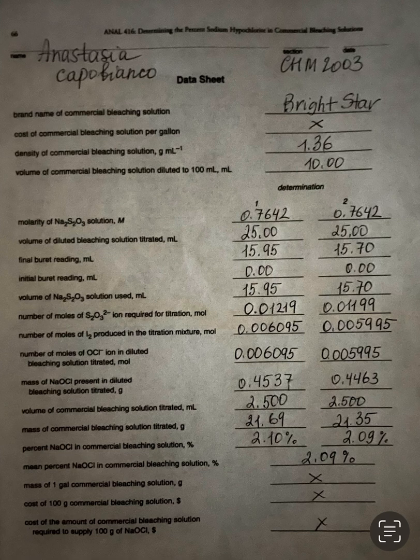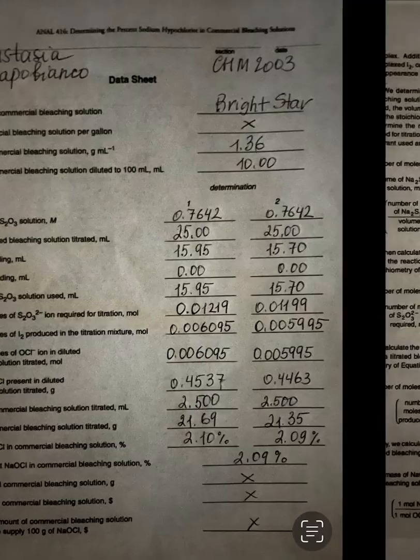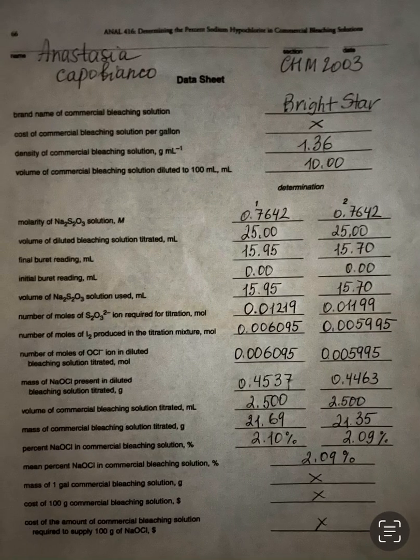Okay. Volume of commercial bleaching solution titrated in milliliters. So they're asking you not to transform it into liters. They're asking you to keep it in milliliters. And you will need equation number 7 in order to do that. So the volume of commercial bleaching solution titrated in milliliters. You're using the volume of diluted bleaching solution titrated. Okay, let's take a look. How much of diluted bleaching solution did we use? Volume of diluted bleaching solution titrated, right?